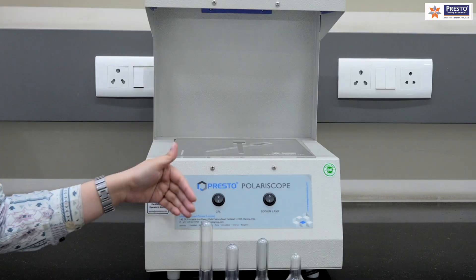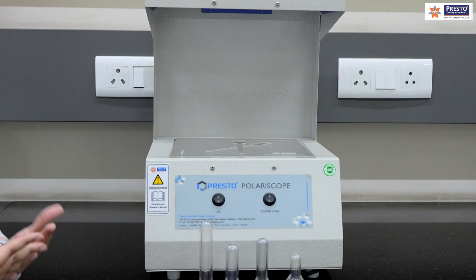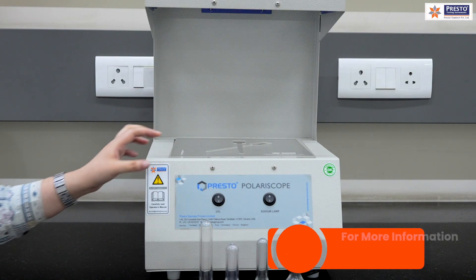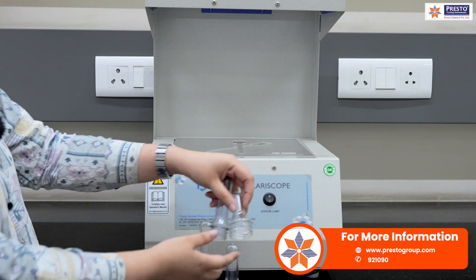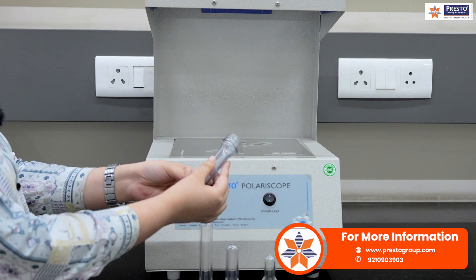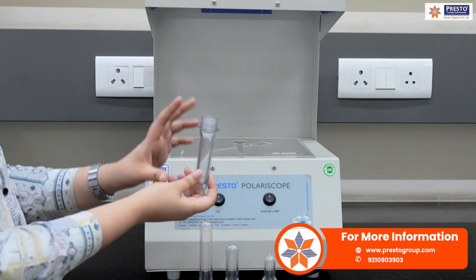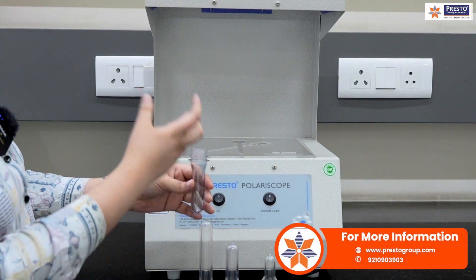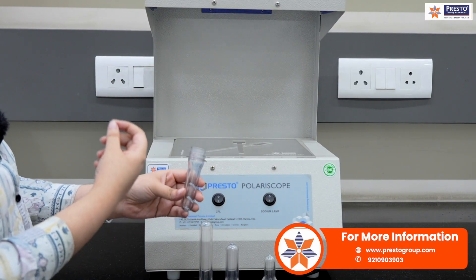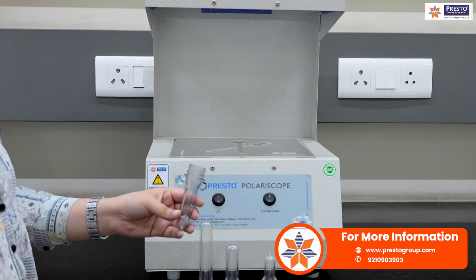Right now I have two samples and I don't know which one is good or bad after the manufacturing stage, but we can see through this polariscope. One sample looks perfect to the naked eye with no visible stress, but the polariscope will show the actual stress level and how optimum it is.